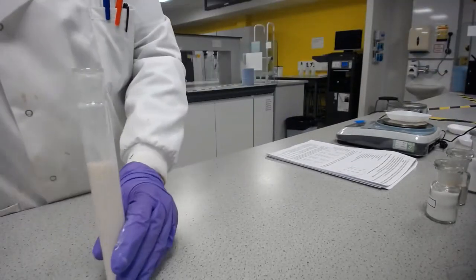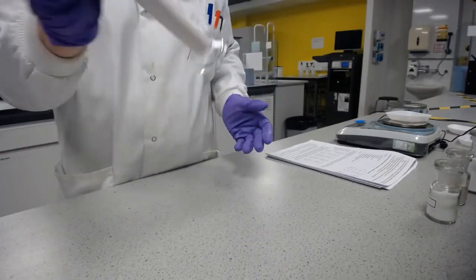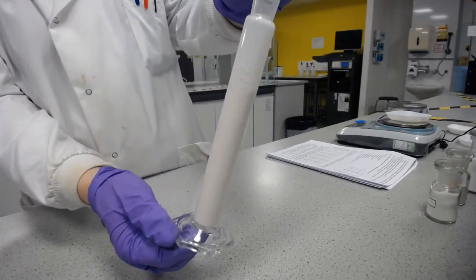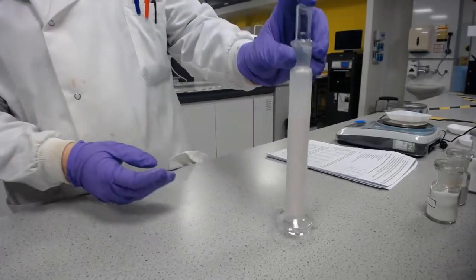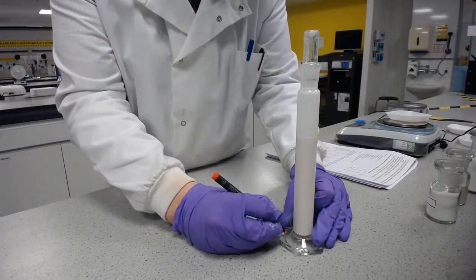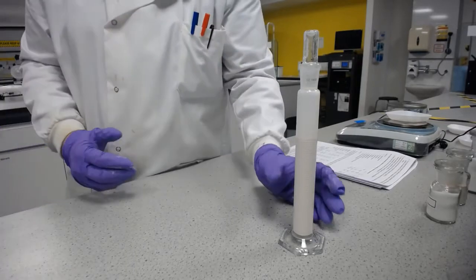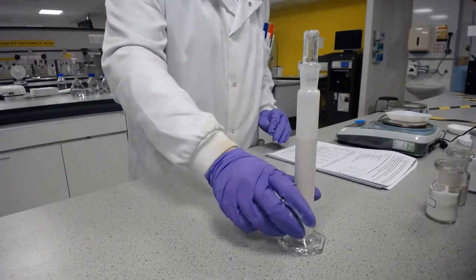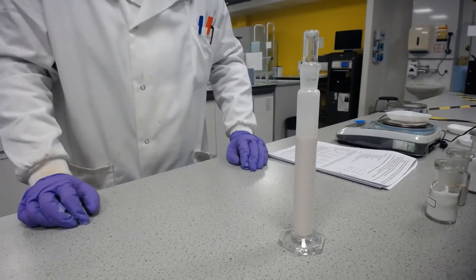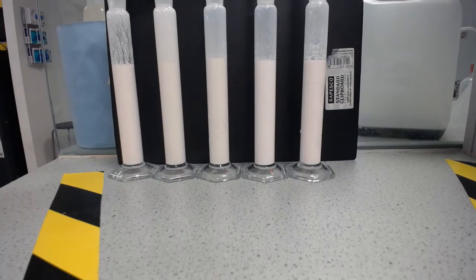So now we're up to 50 millilitres, the final volume of the formulation, and I can give it a good shake, and we now can see we have a nice pale pink calamine formulation. So that was formulation C. I'm just going to mark it as such. I'll now carry on and make the other 4 formulations, and then I can put them at the end and we can have a look at their stability and see how well they fare against each other.